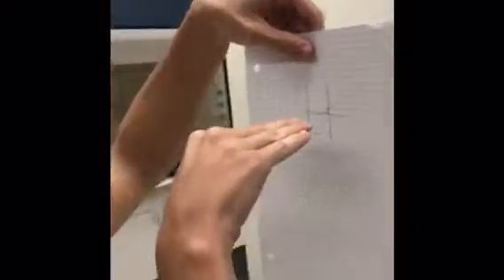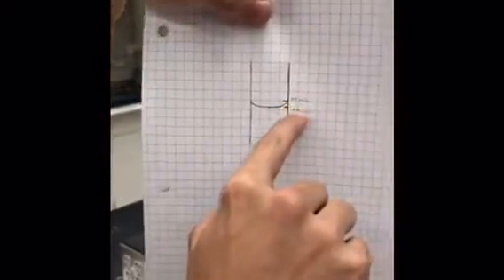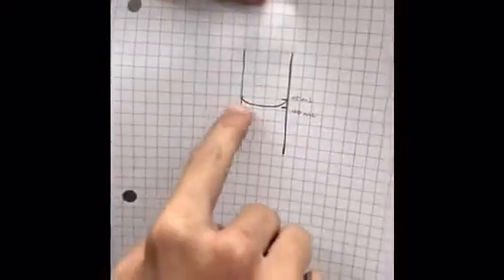The way you read a meniscus is, you're going to hold it at eye level and look at it head on. The very bottom portion of the meniscus is going to be the reading. So it's not the top, so it's not going to be 45 milliliters, but it's going to be 40.